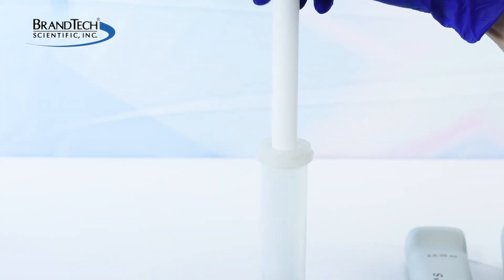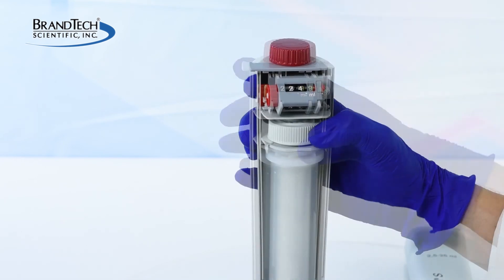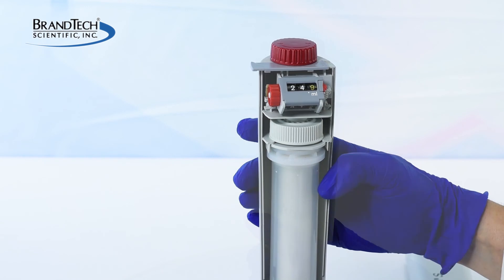And reassemble. Remember, the piston from one Dispenset should never be exchanged with another.